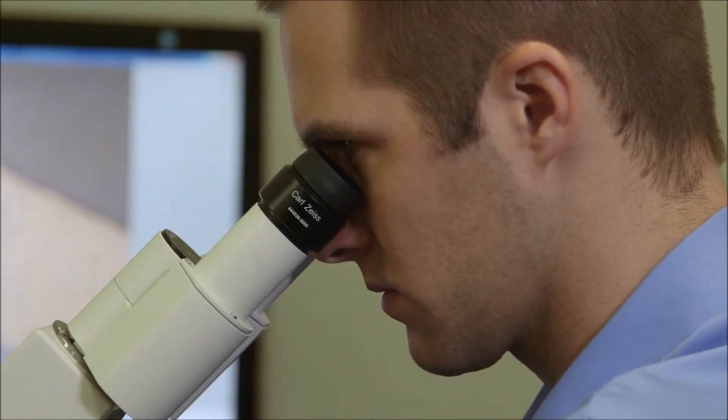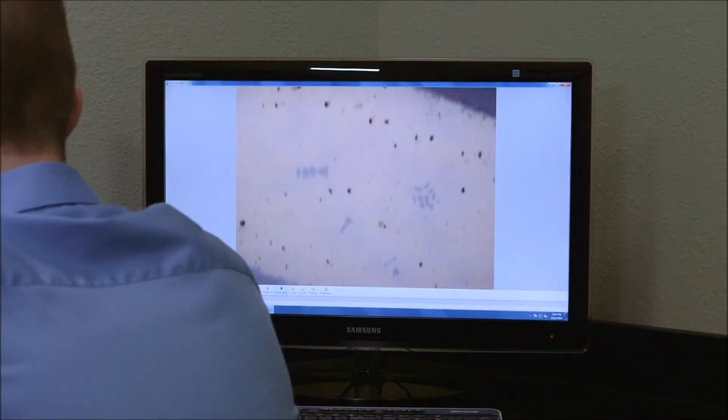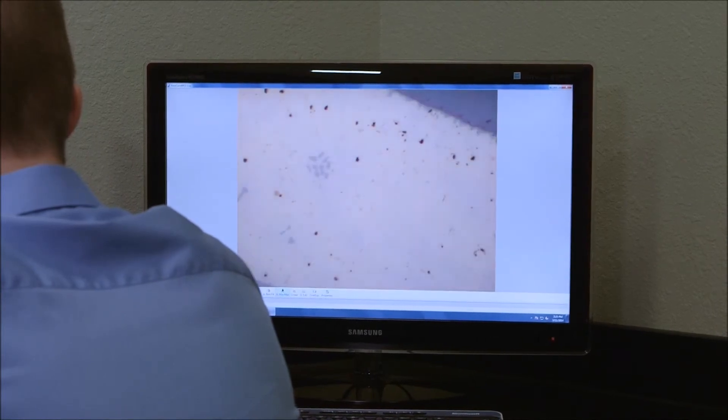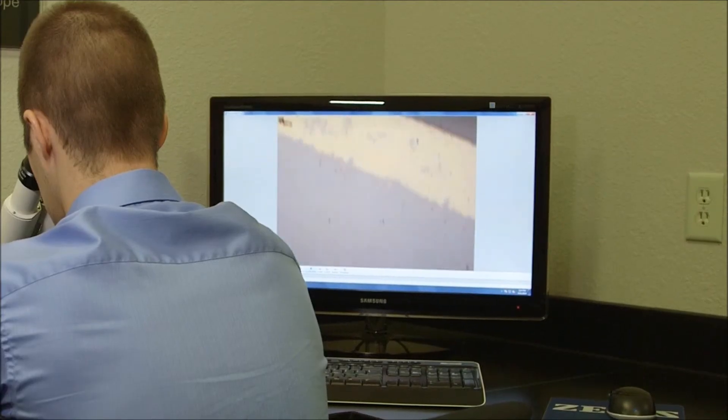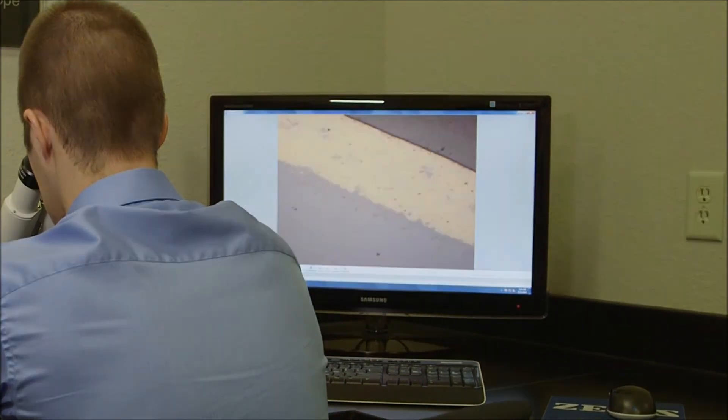Once we are analyzing this microstructure under the scope, we can also identify what is the thickness of the coating, what is the average carbide percentage or porosity percentage that might be within our coating. We can also identify if there are any unusual phases that might be existing in the microstructure.